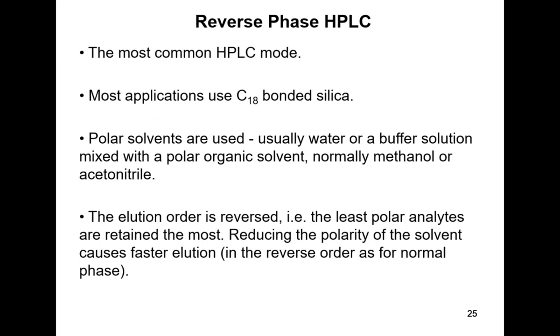So that's probably a good place for a break. What I'll be doing is discussing in a little bit more detail the most common bonded phases, which is the long hydrocarbon chains, referred to as reverse phase HPLC. So a 15-minute break, so just a little bit after 7:25 I'll resume.